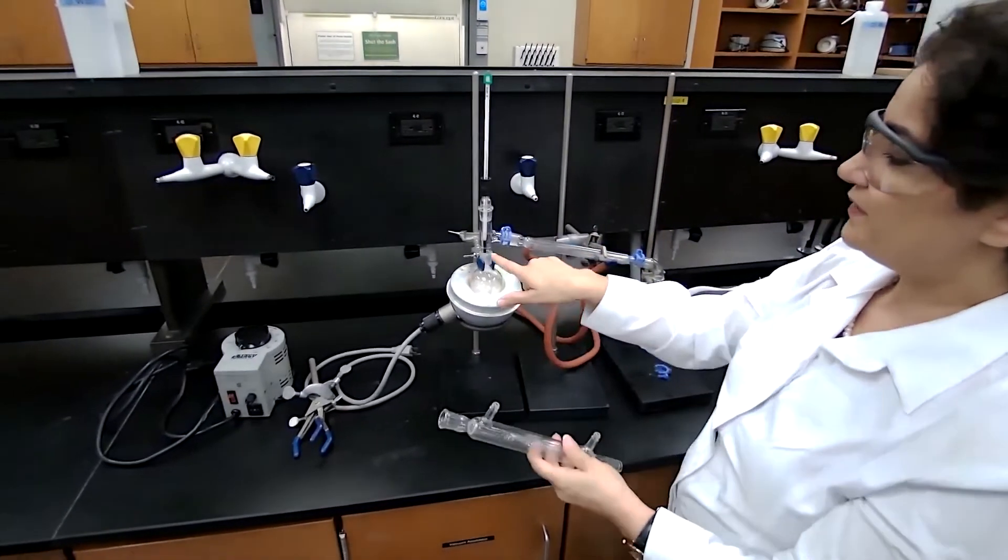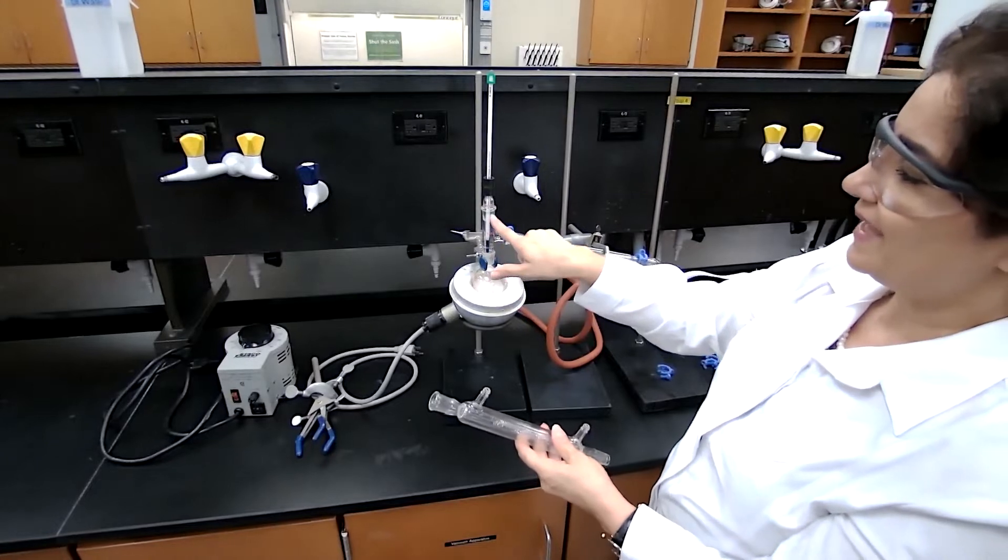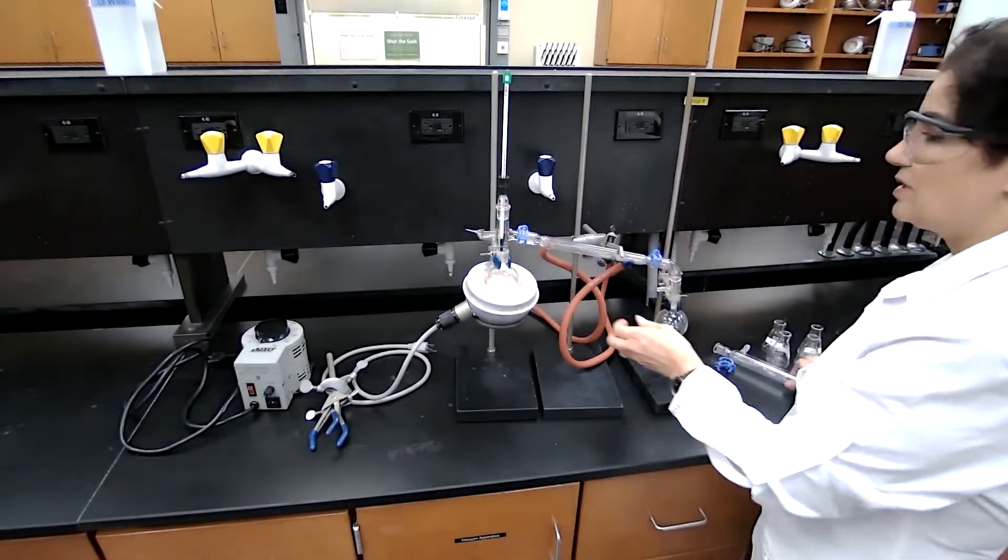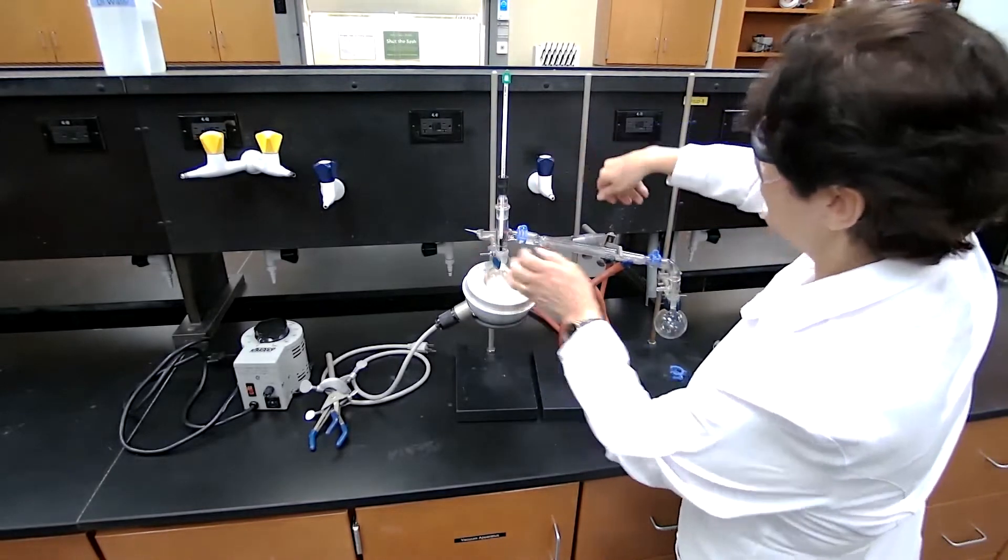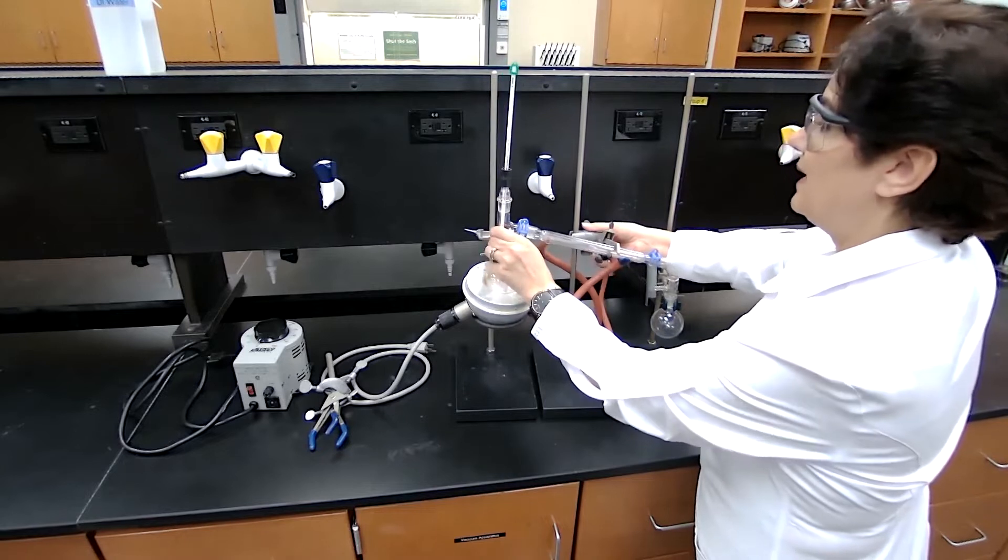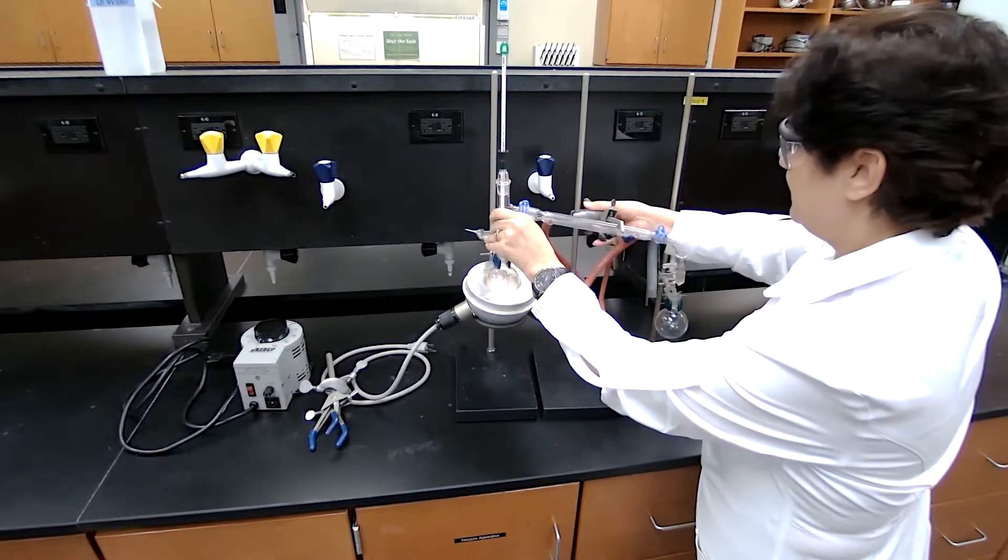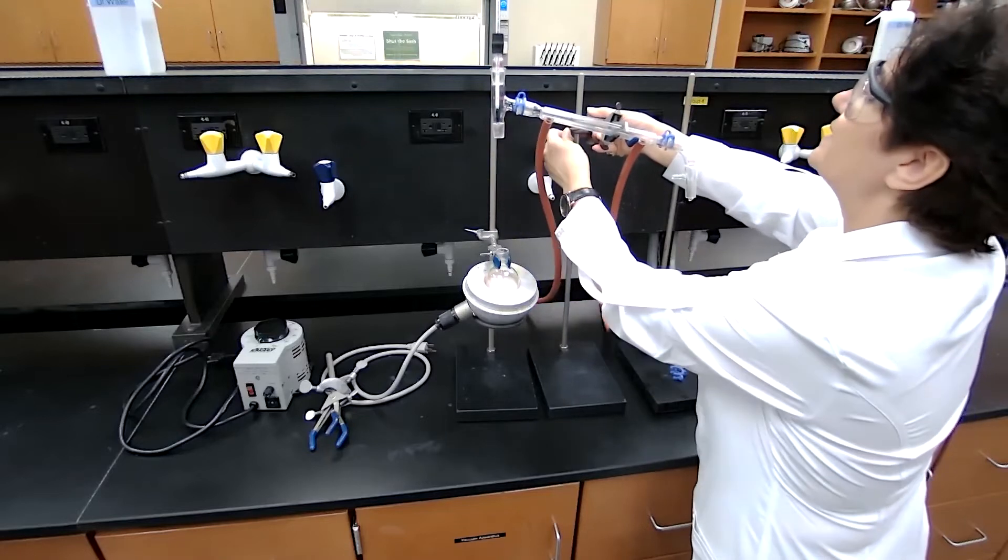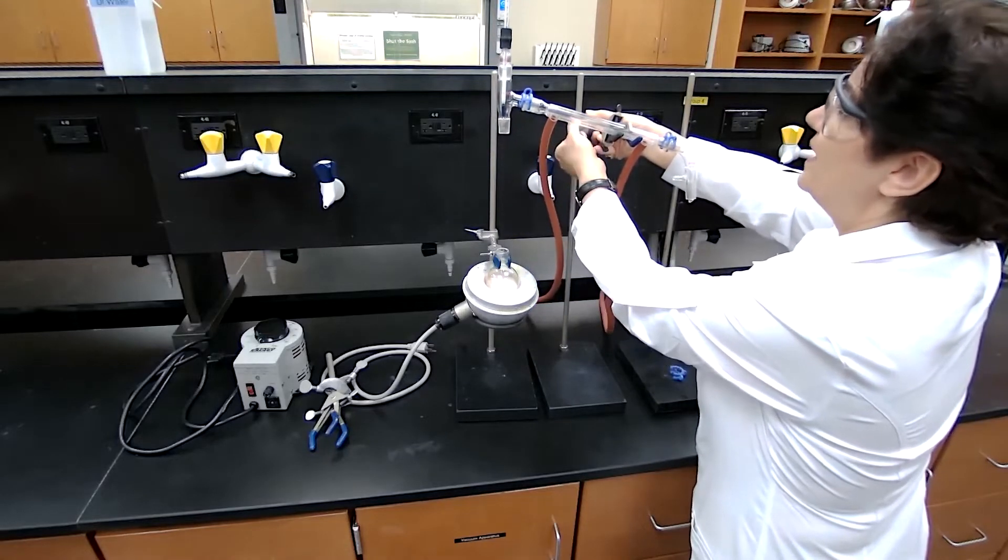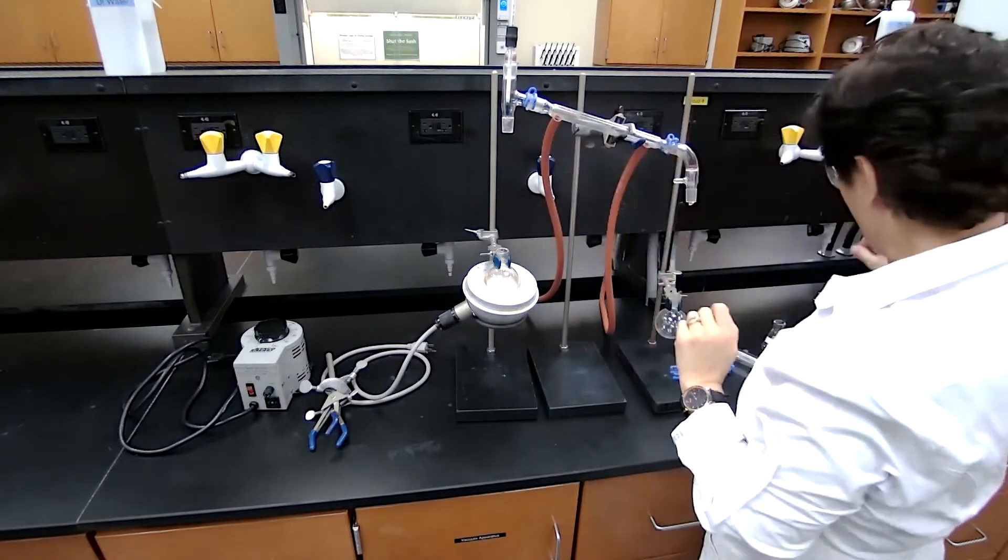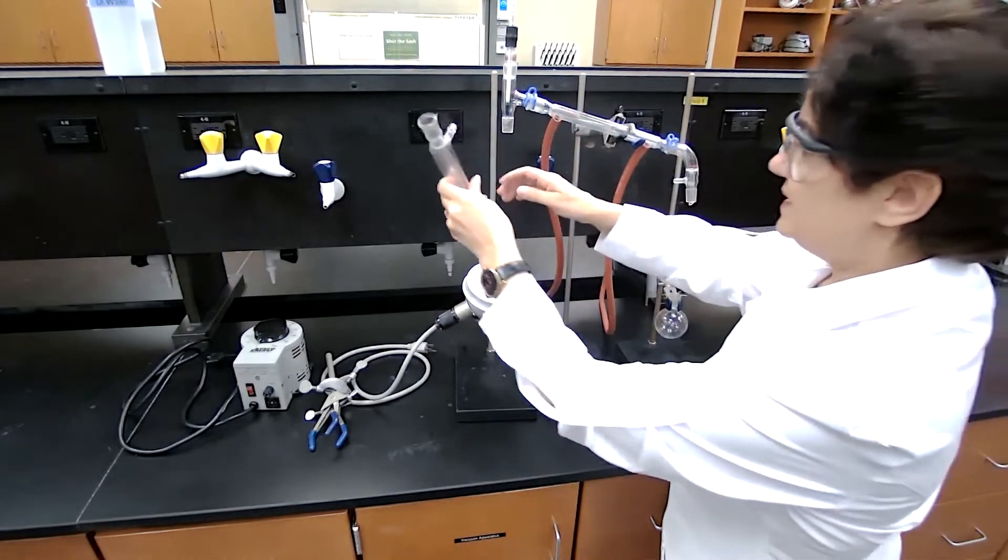To do that I need to increase the height for everything else. I will keep the boiling flask at the same height that I have. I'm just going to make the distillation head higher.